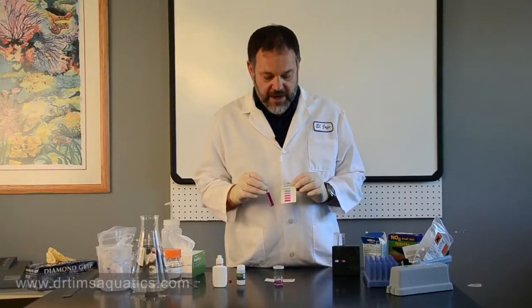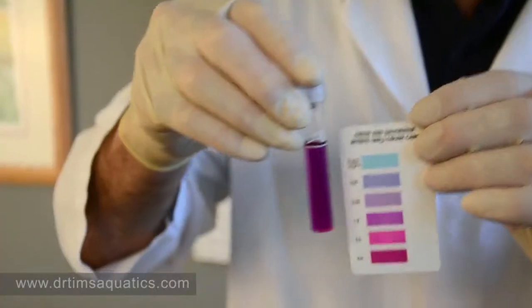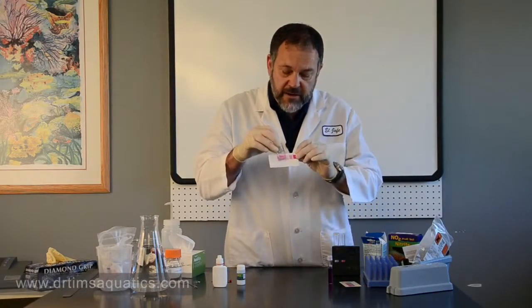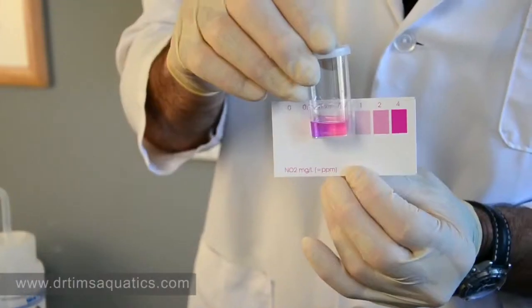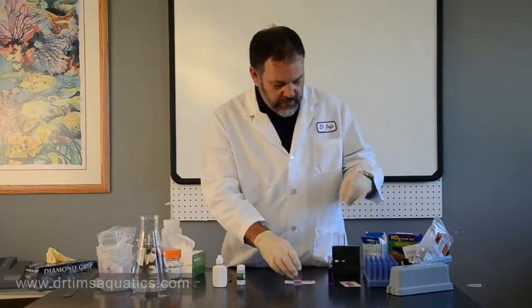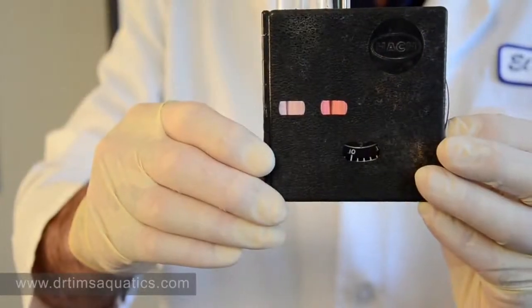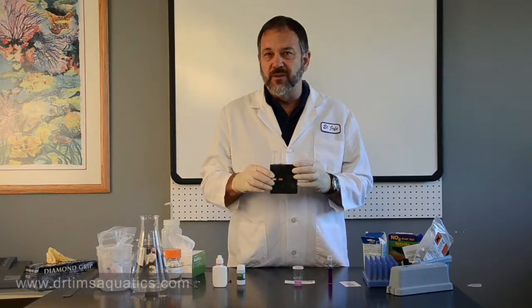After waiting the requisite time, with the API kit you can see that with the dilution we're no longer in the light blue-green — we're down in the purple, reading about one part per million. The Salifert is reading pretty much the same, right between one and two. It's definitely registering now, not that clear liquid we had with the undiluted sample — again about one part. With the HAWC test kit, we are definitely registering a color, and it's going to be about 0.2 to 0.3.